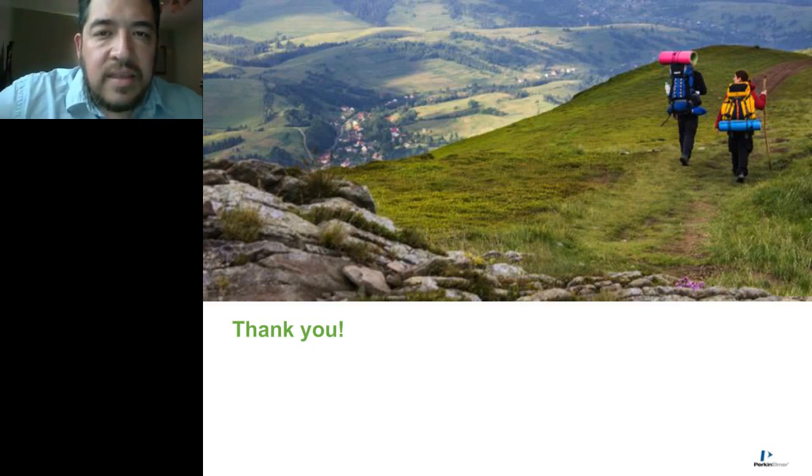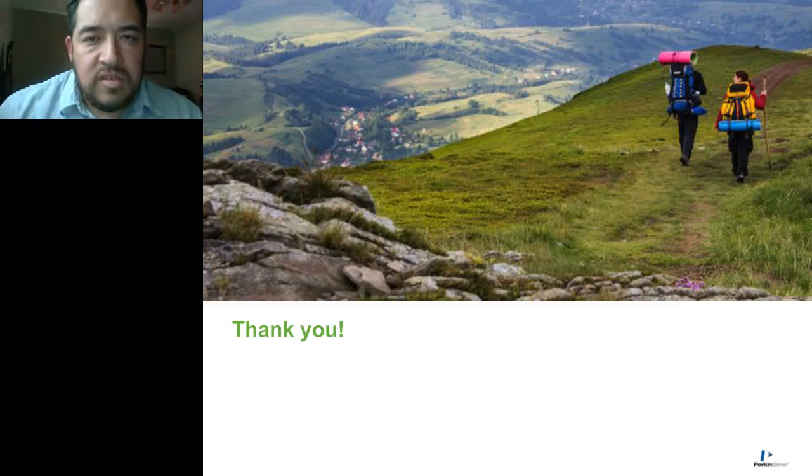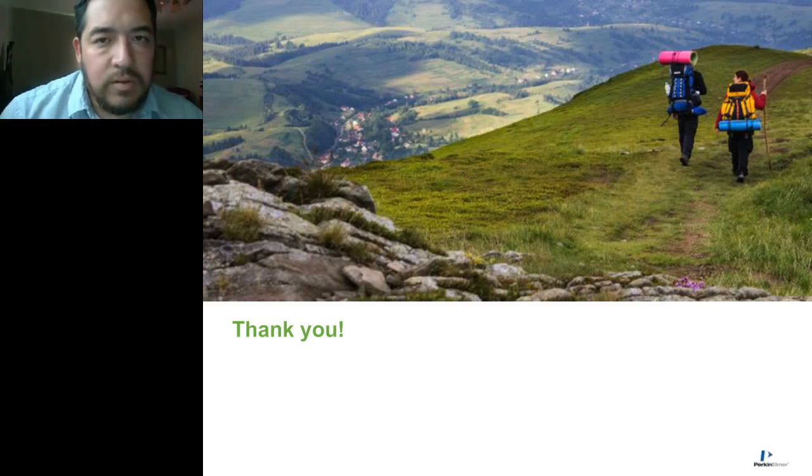Yeah, thank you for the question. Right now, as we're focusing on this from a research application, we have not explored that at this time. In terms of working with research collaboration partners, that would certainly be of interest. But currently we don't have any other data, other than saying that we do see, and this has been published in the literature, that the circulating tumor DNA does show a smaller size than the circulating cell-free DNA from quote-unquote normal patients.